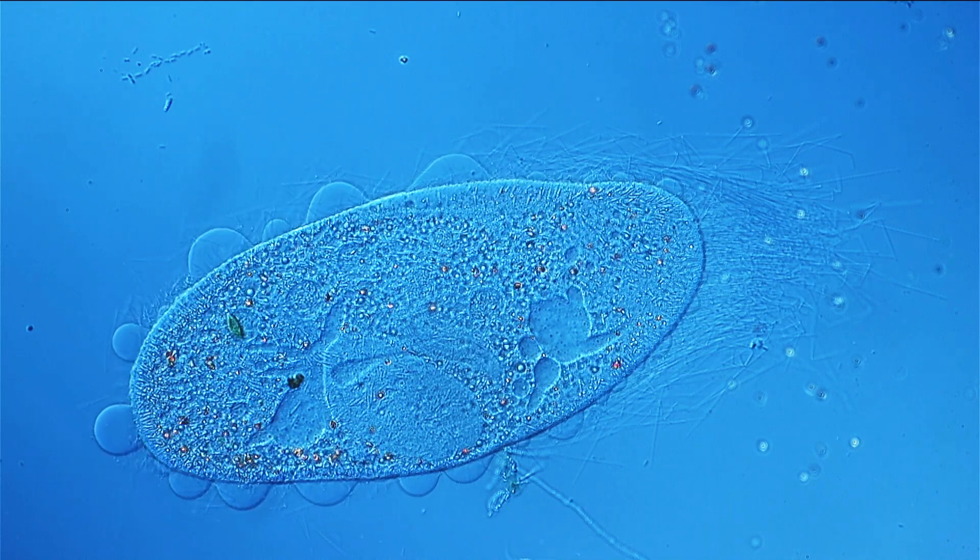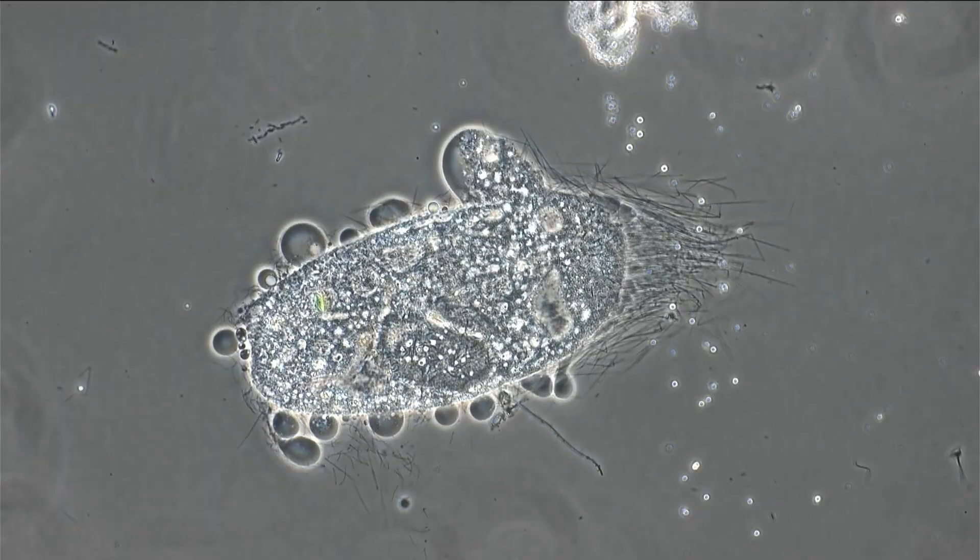Also interesting to look at, but essentially that's sometimes something you don't want to happen, obviously, because then you're not able to observe the cell very well. Another disadvantage is because it's pressed so flat, it's kind of wider now and it kind of loses its natural shape.